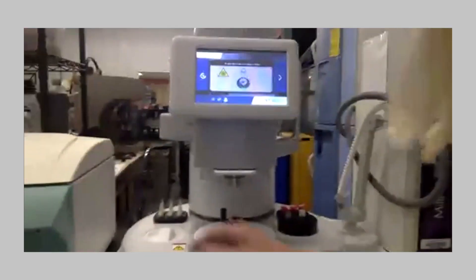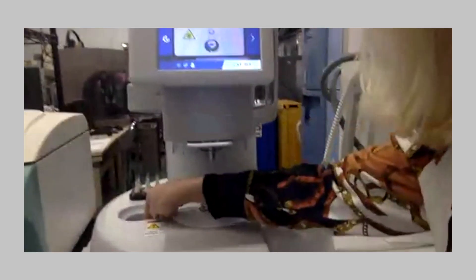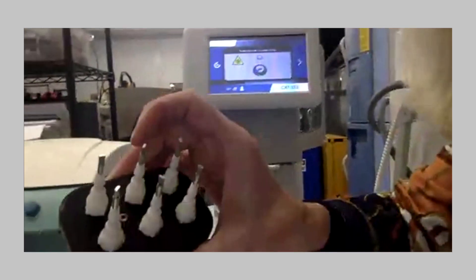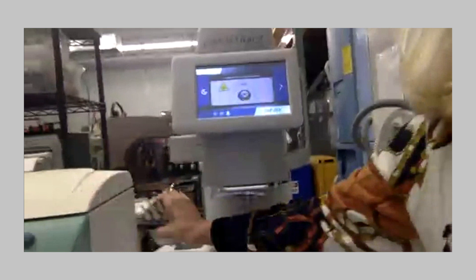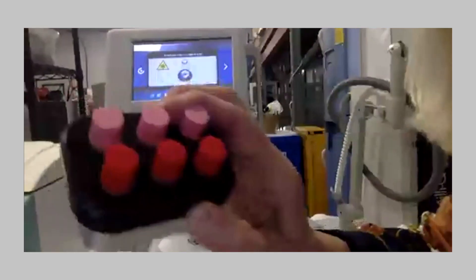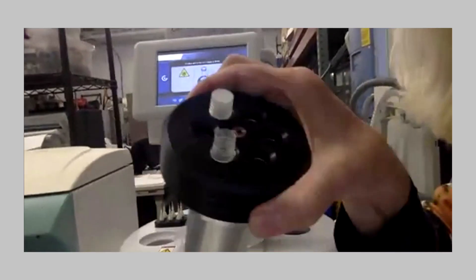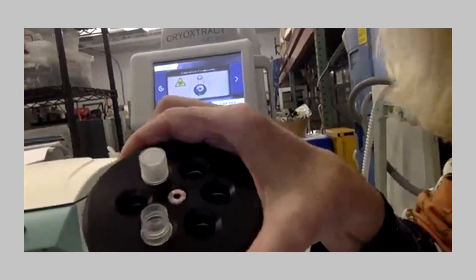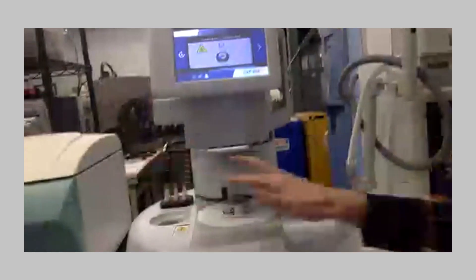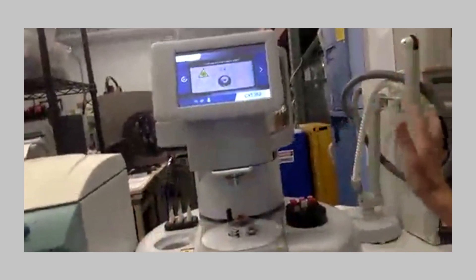The main parts: there's a porthole in which you will pour your liquid nitrogen. We have a chilling rack, which is removable and holds our probes — on this model it holds up to six. It has a rack which can hold your tube types, and a destination carousel which holds the tubes into which you're going to extract your frozen cores. All of these are interchangeable, the nests can fit any tube size, and they're easily removable for easy cleaning.